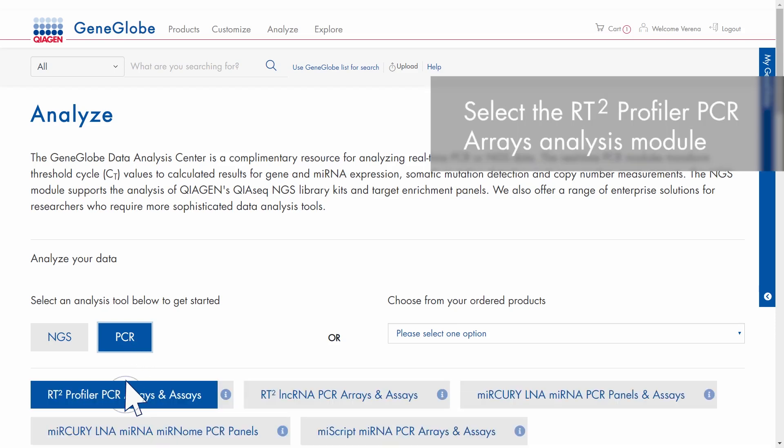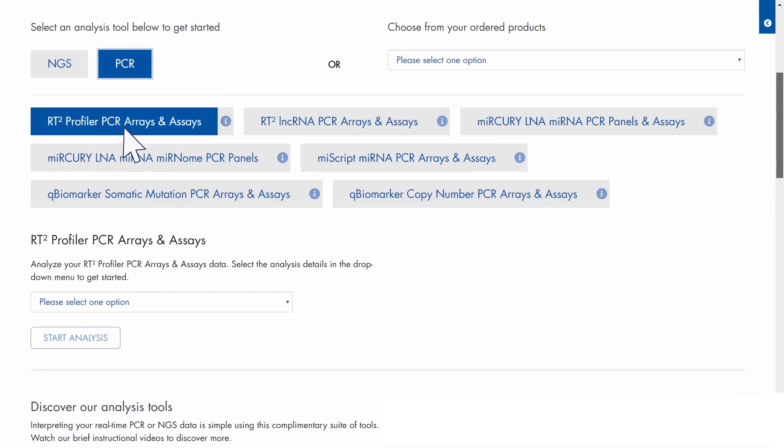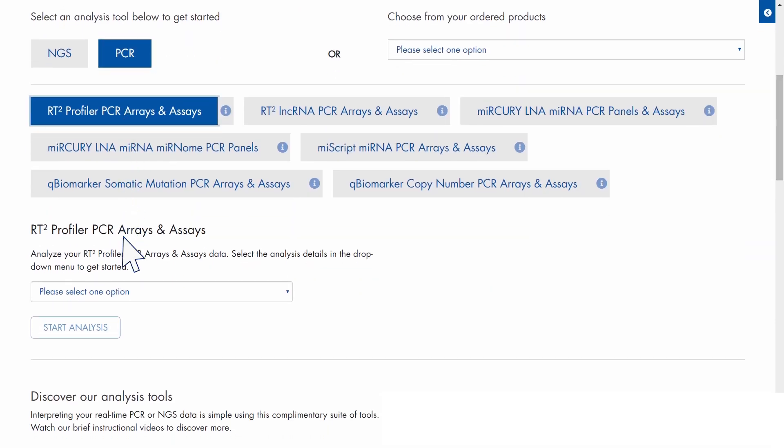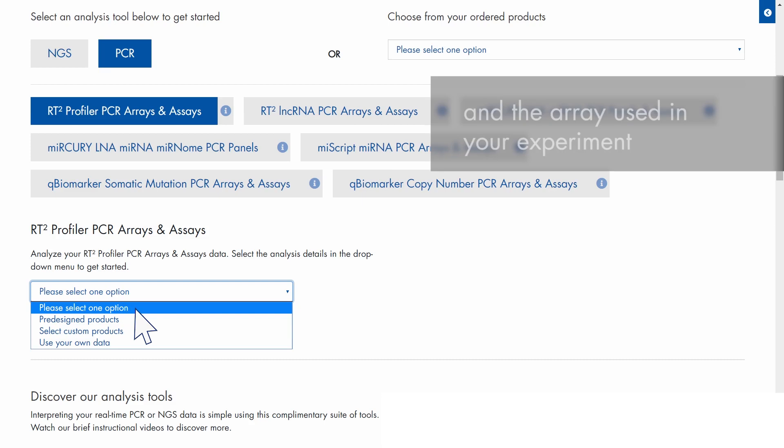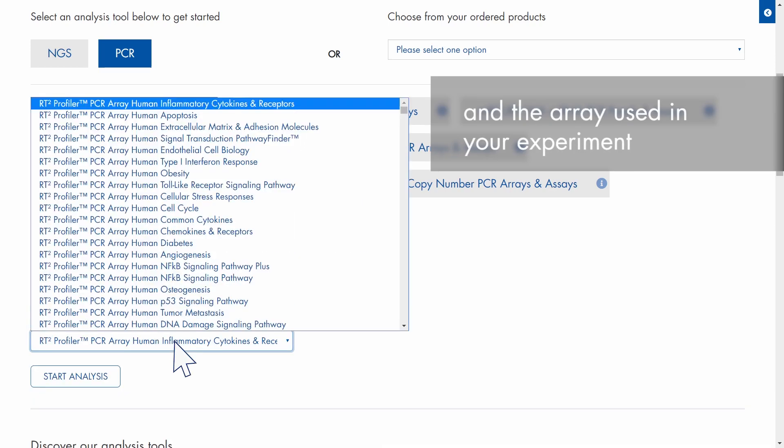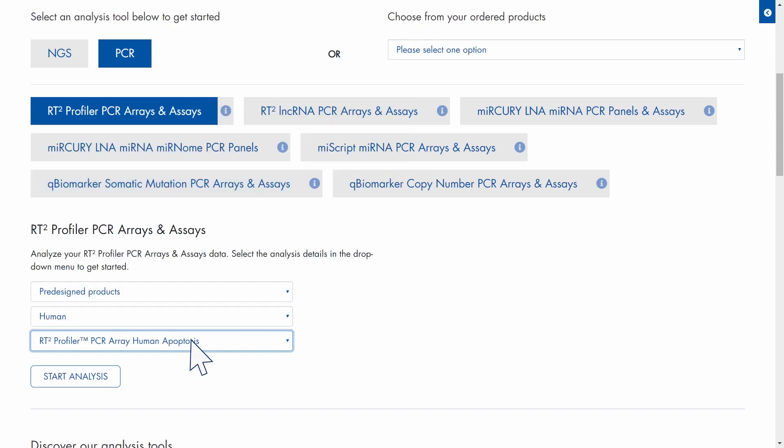Select the RT-squared profiler analysis module, filter by type and species, select your array and start the analysis.